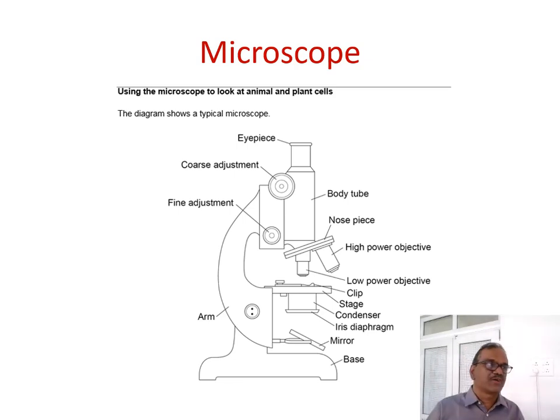Sometimes they will use 5x also, but the same 10x lens is used in a small instrument.